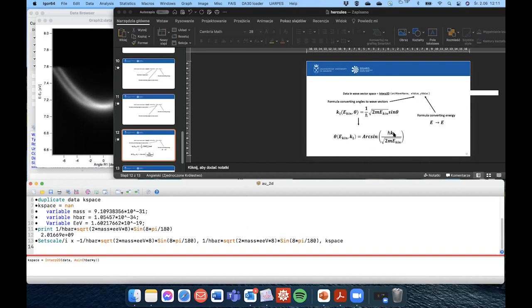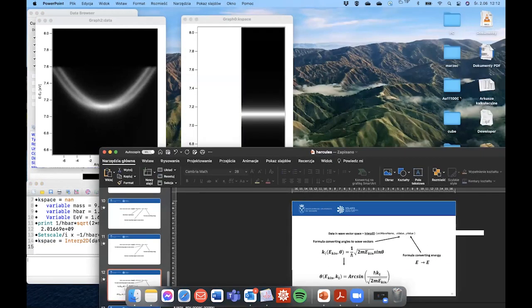So we have to type y. It is divided by the square root of, and once again this time the x-axis. Okay, and that should be transformed to radians once again. So let's see if it does work.